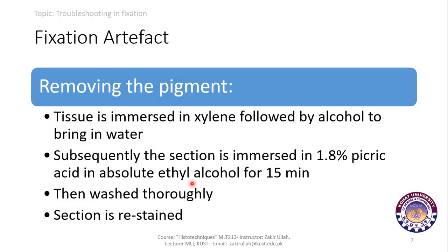How can we remove this pigment, how can this issue be resolved? First, the tissue is immersed in xylene and then it is put into alcohol, to bring it to water for rehydration purposes.